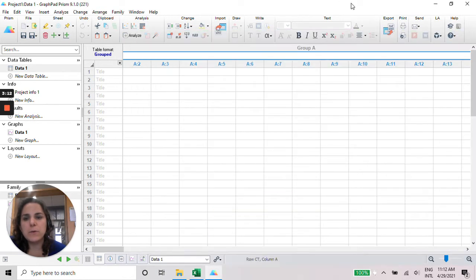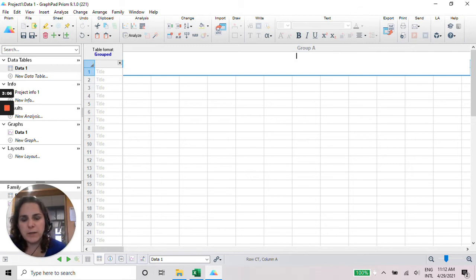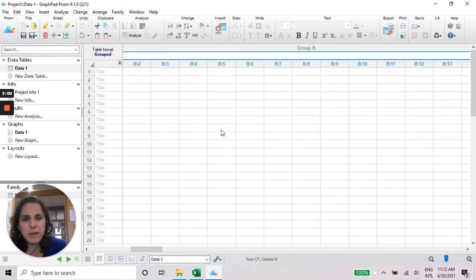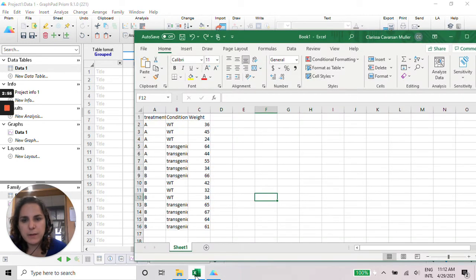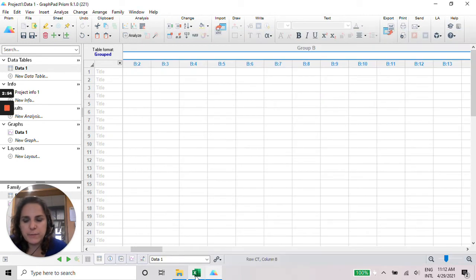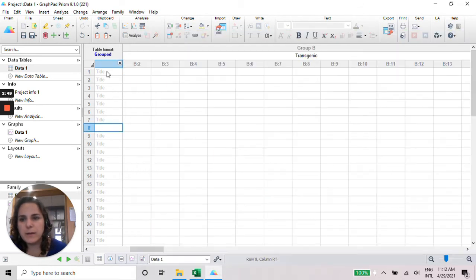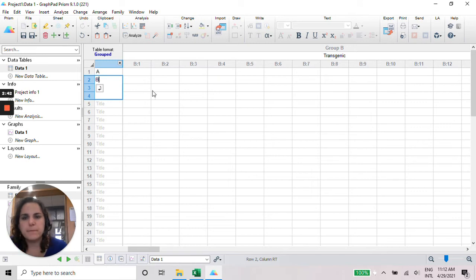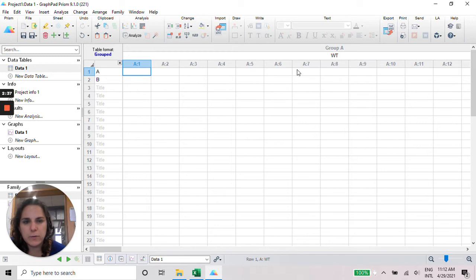So in here I can write the treatment should be treatment A or B, and condition, let's put here the condition wild type, and the next one is transgenic. And then here it's going to be the treatment A or treatment B.